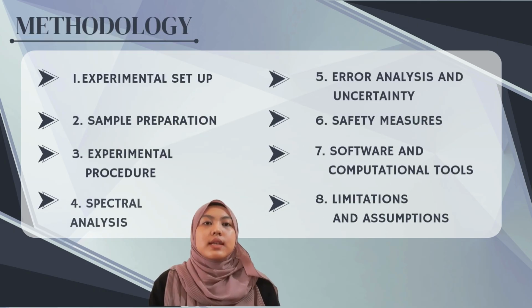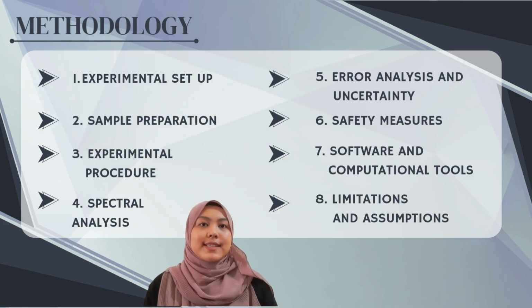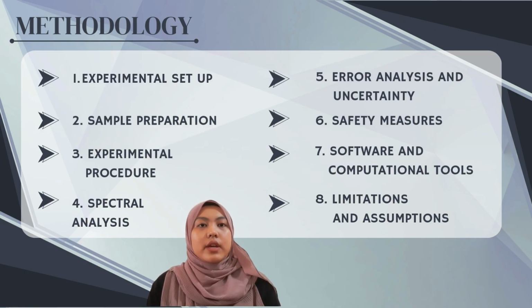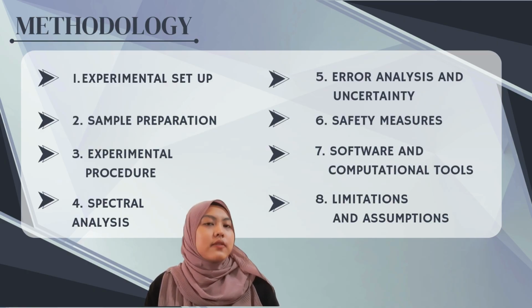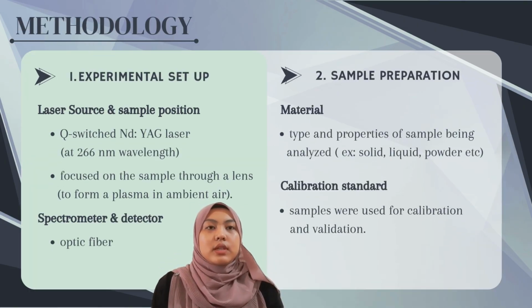The methodology of LIBS analysis can follow these eight steps: experimental setup, sample preparation, experimental procedure, spectral analysis, error analysis and uncertainty, safety measures, software and computational tools, and limitations and assumptions. Next, I will explain the experimental setup.